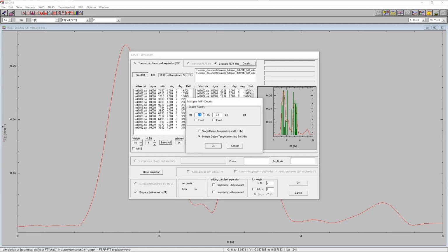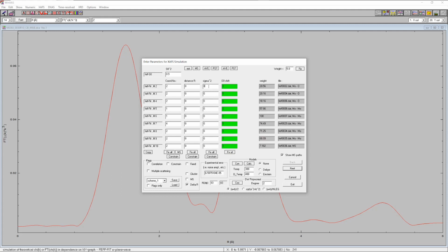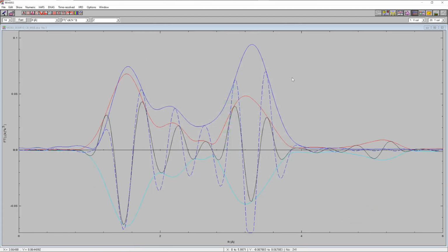For the concentration, we're going to select what we just determined from the LC XANES fit results, 55% of the first phase, which is molybdenum dioxide, and 45% for the trioxide. And since we know this number from the XANES analysis, we're going to keep those concentrations invariant in the refinement. So, okay, and just for the simulation, just going to copy and exit, and so this is a reasonably good agreement for starting parameters for the refinement.